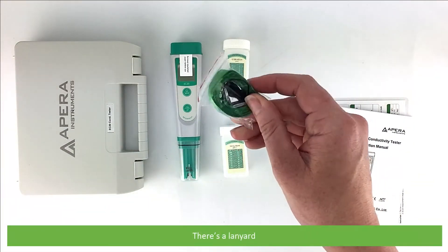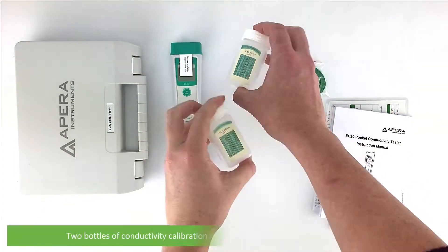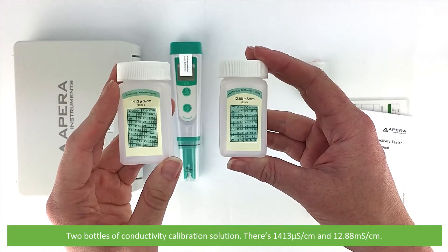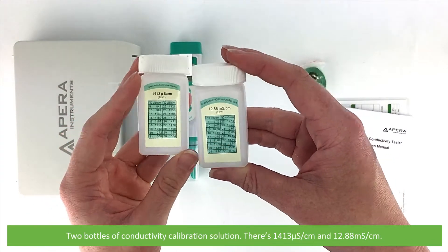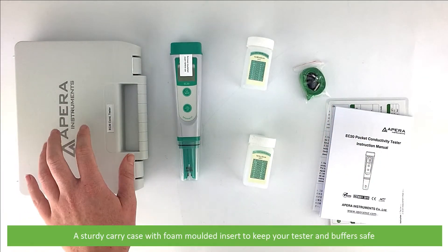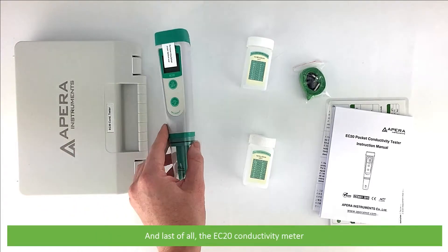There's also a lanyard, two bottles of conductivity calibration solution — 1413 microsiemens per centimetre and 12.88 millisiemens per centimetre — a sturdy carry case with foam moulded insert to keep your tester and buffers safe, and last of all the EC20 conductivity meter.